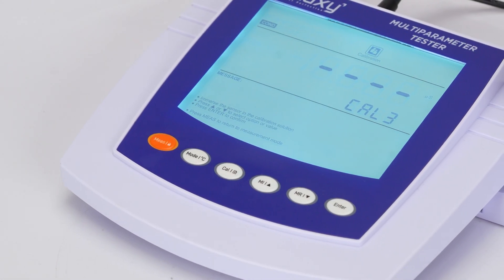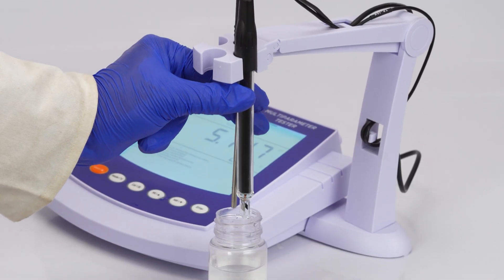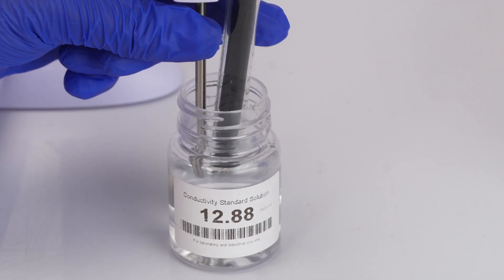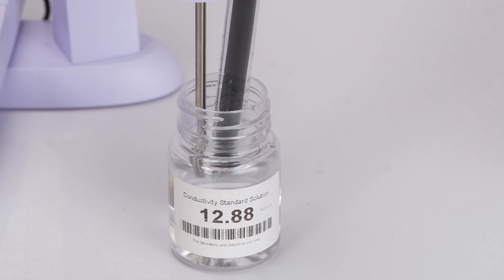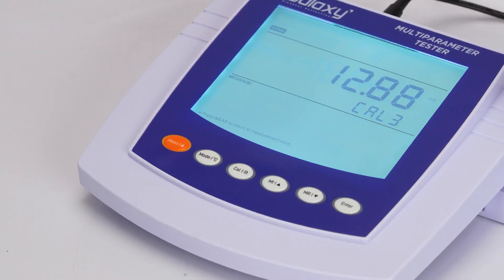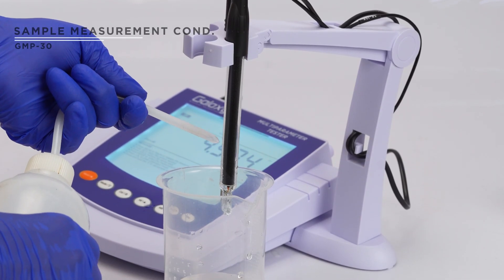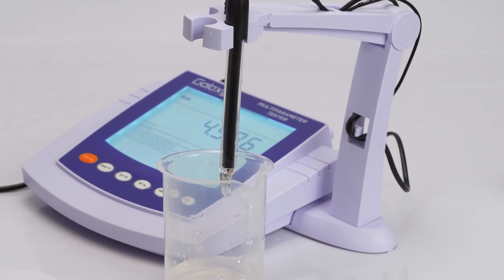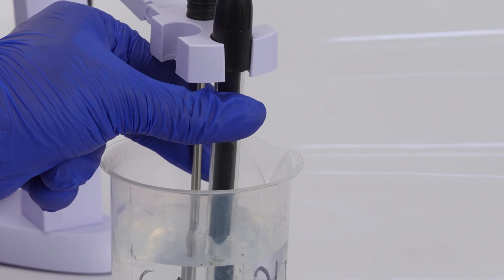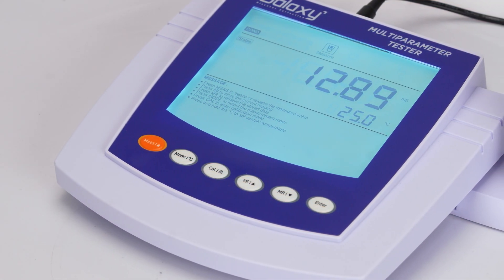When cal three displays, rinse the electrode and immerse it in the third buffer at 12.88 millisiemens per centimeter, then press enter again. The display will confirm calibration complete. Rinse the electrode with distilled water and place it into the sample. If auto hold is enabled, the meter locks the measurement when stable.